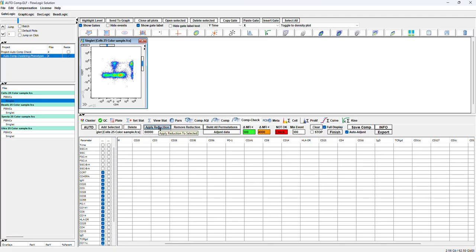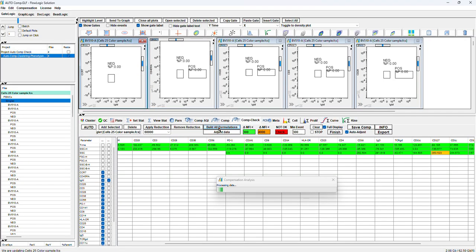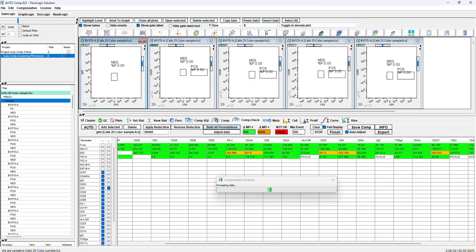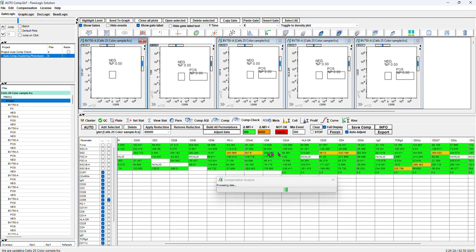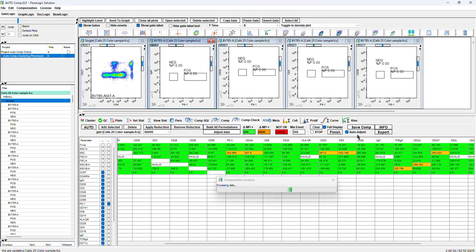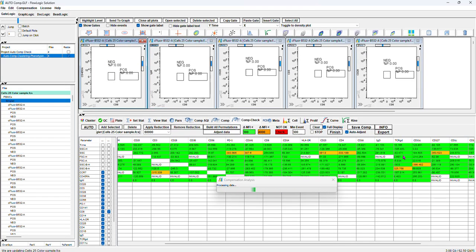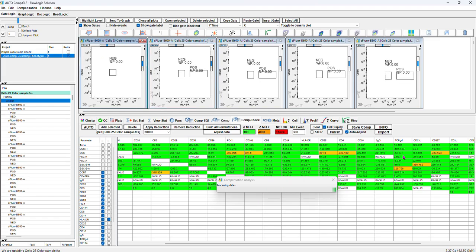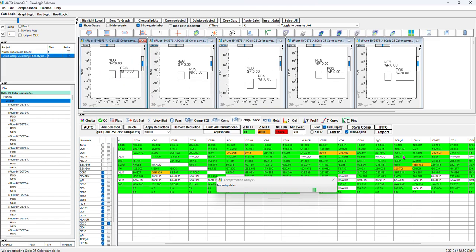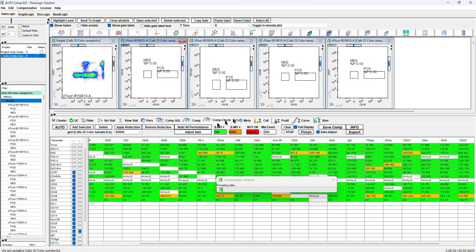This is just a review of what we did. Rebuild all the permutations, and you can see that some permutations get yellow because the gate was set to auto adjust. So the gate got moved toward the end. Now the gate restarts again at the beginning where it was. So it's the manual process.